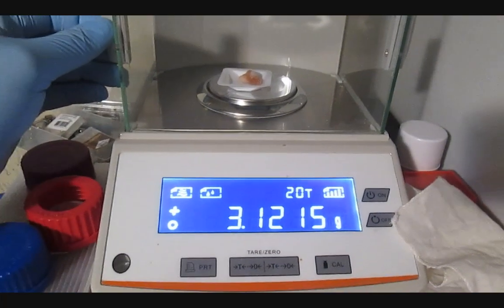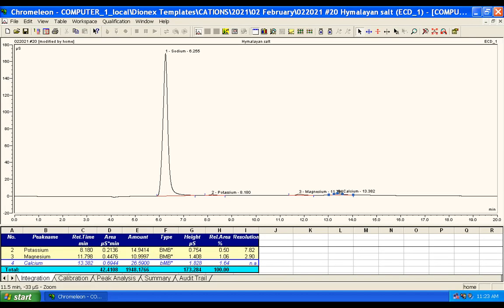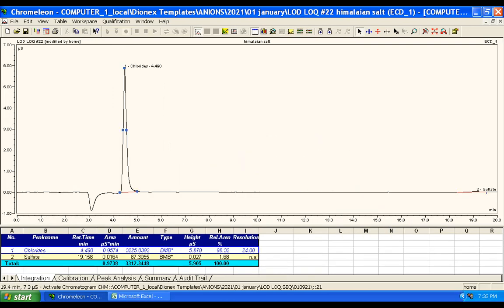So I weighed a crystal and dissolved it in pure deionized water and ran it at a thousand-fold dilution. Sodium is the very large peak over here, but zooming in on this area reveals potassium, magnesium, and calcium. This column is not rated for iron and copper. The anion side shows chloride and trace amounts of sulfate.